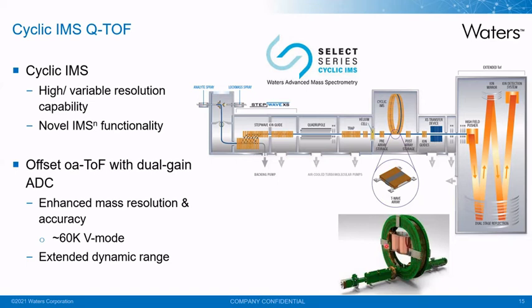And this in itself allows for improved resolution and separation based on the molecules traveling through the mobility cell. It allows us to optimize this even further by separating and then fragmenting. We can move things in and out, back and forth in this cyclic device to cut out resolved peaks and then re-inject them into the cyclic device to improve separation further.